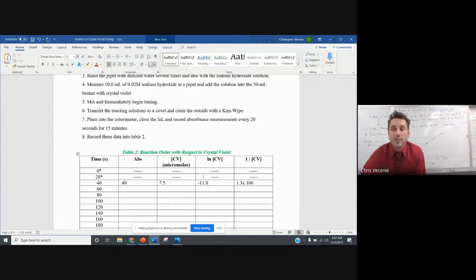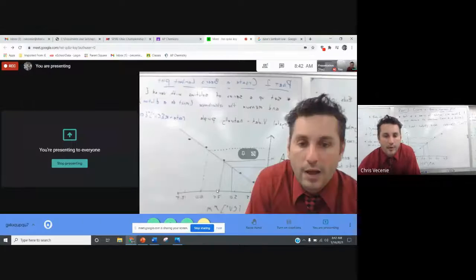So that's the theme of the experiment. Hopefully all that's sinking in. Like I said, I'm not even going to take you to the back because you've seen the process already. All I would do is take a cuvette, inject some sodium hydroxide, and then monitor it over time. It would be a lot of sitting and watching for numbers. You guys have those numbers. So get with your partner, start rolling, and I will be around for questions.